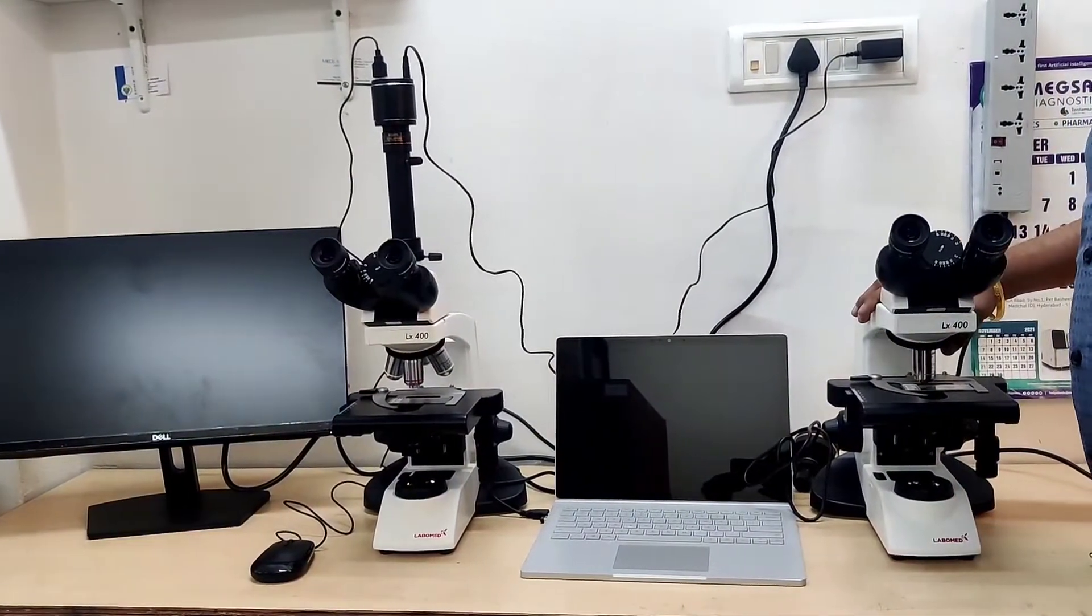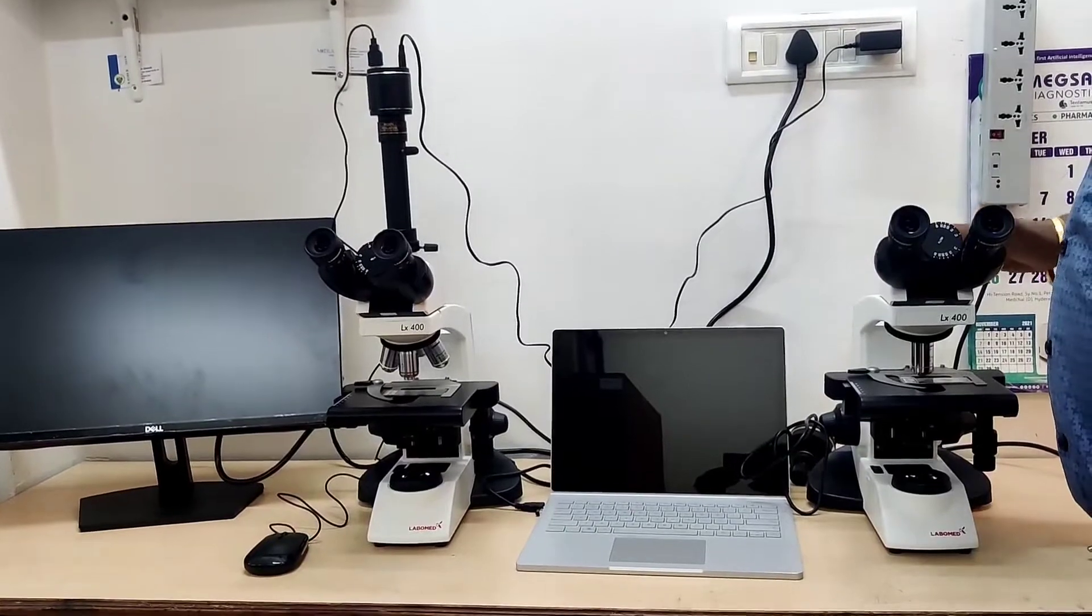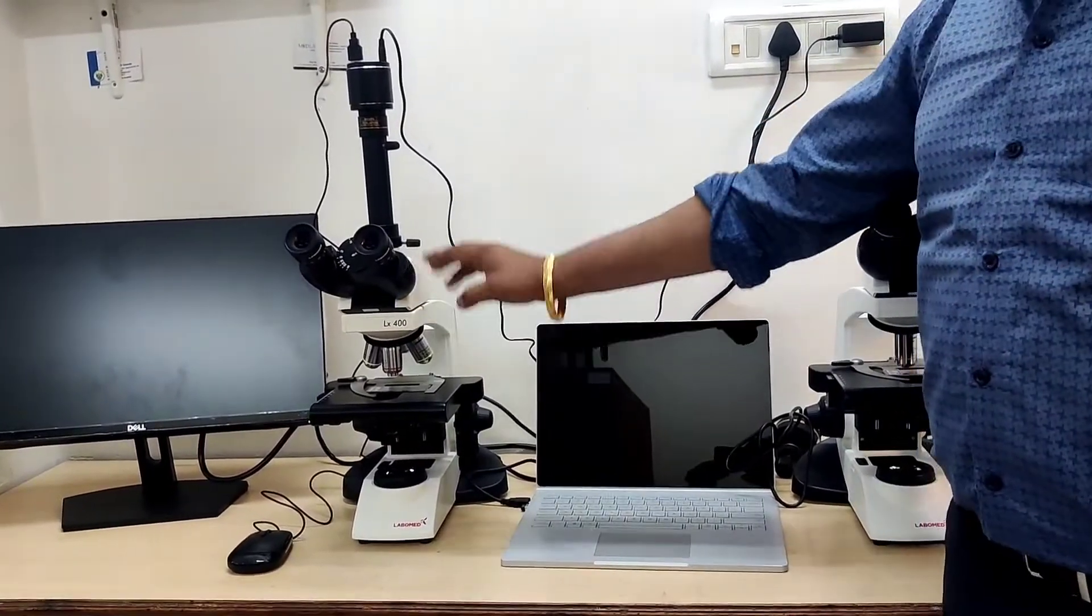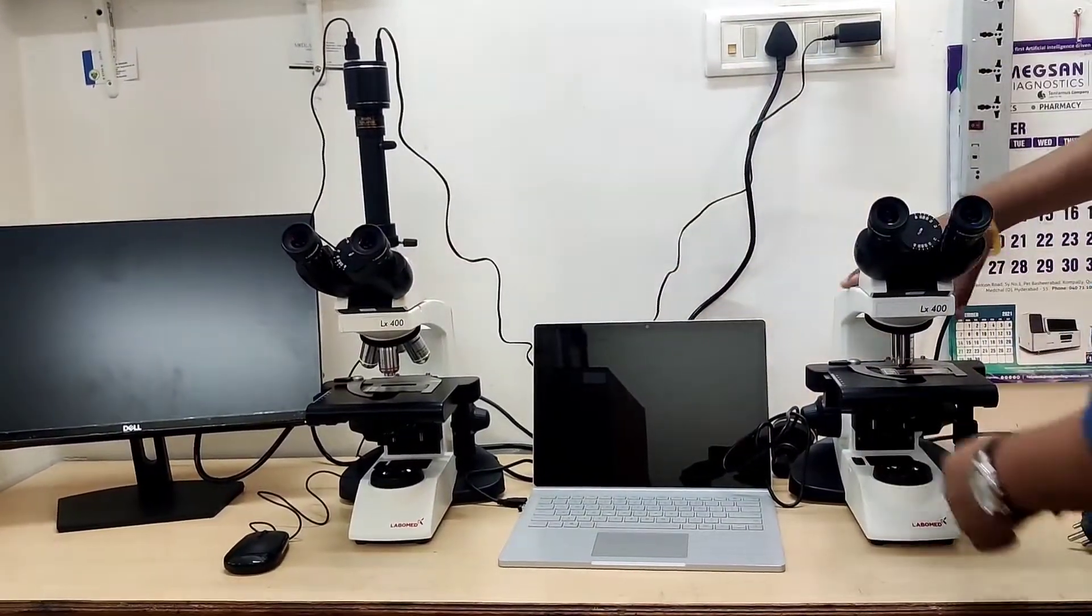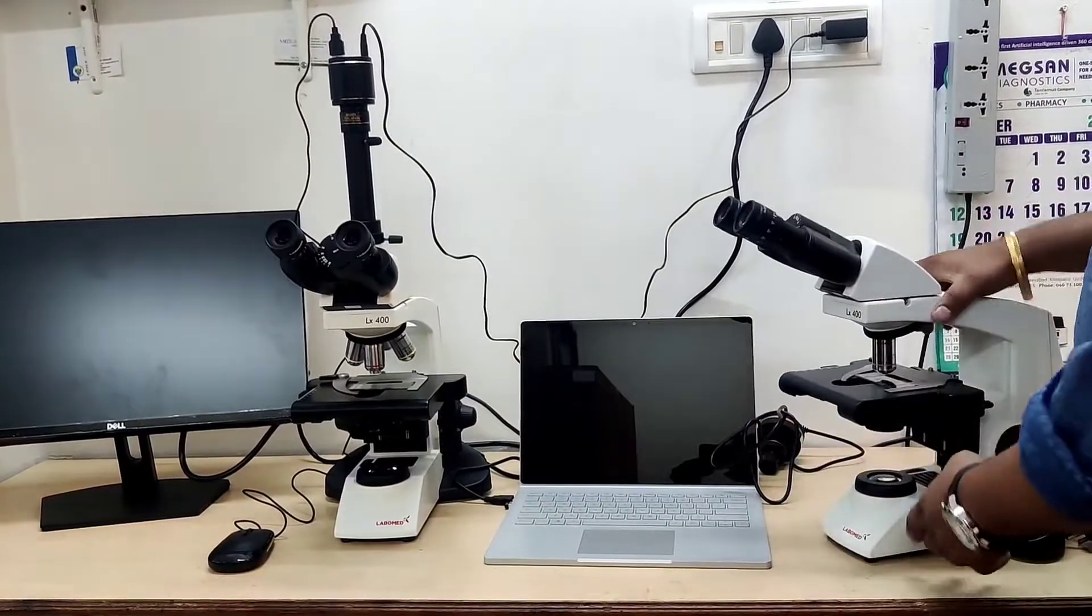Today we are presenting the difference between LX400 Binocular and LX400 Trinocular. First, we will talk about the specifications of LX400.